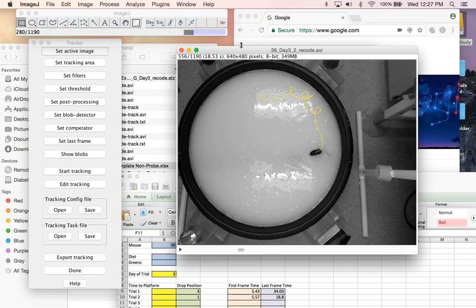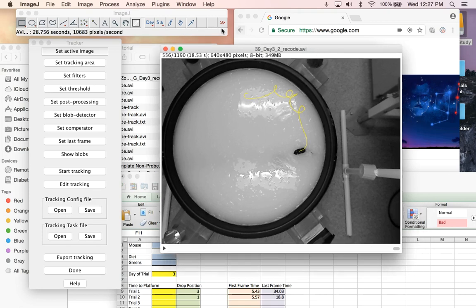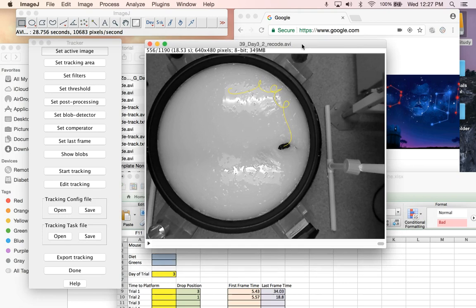And once it's done saving, there's one last thing to do. So it's almost done. Okay, so now it's done. Once the status bar is finished, it doesn't give you any other indication, but the status bar is finished.